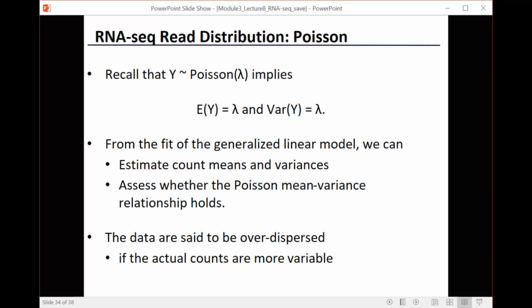Do you know what distribution we use to model those sparse events? Yes, Poisson distribution. Similarly, the number of reads mapped to a gene of 1 kb long, for example, over a 3 billion base pair genome is also a sparse event. It also uses Poisson distribution to model such a sparse event.